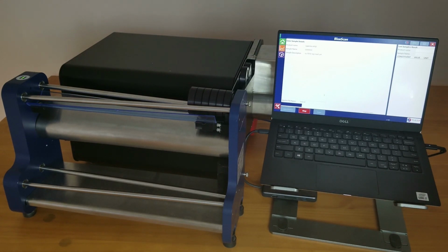After they are scanned, samples are fed down to the lower rail of the autosampler, where they can be retrieved at any time. Additional samples can be added to the upper rail, so you could be running this non-stop throughout the day by continuously adding samples to the upper rail.